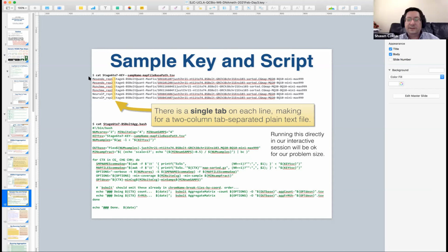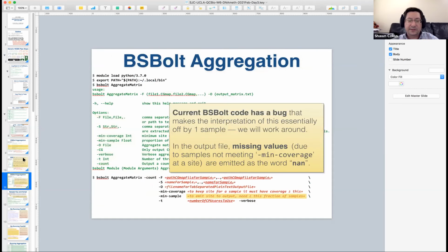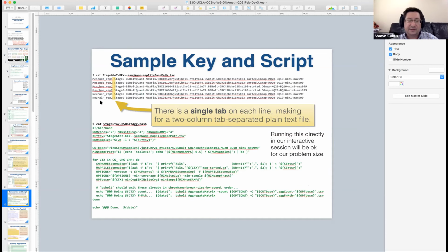So okay, we've got everything ready. We have to compose our command, make the script, and run it and all this stuff. It's probably too much to ask to pack all the knowledge about the file names and the sample names into the command line directly. So we're going to make a little file that has the pairings of those.